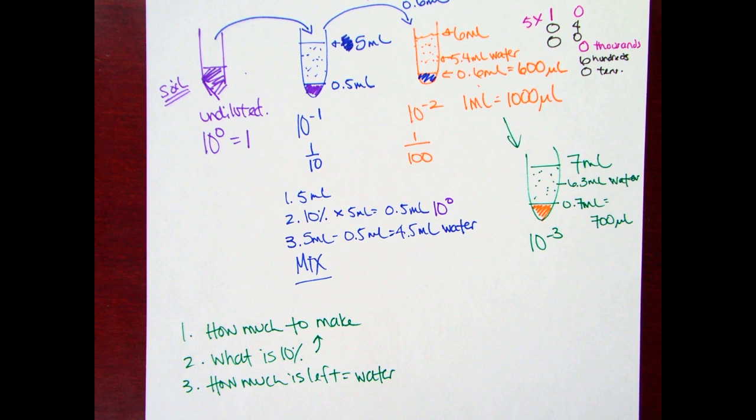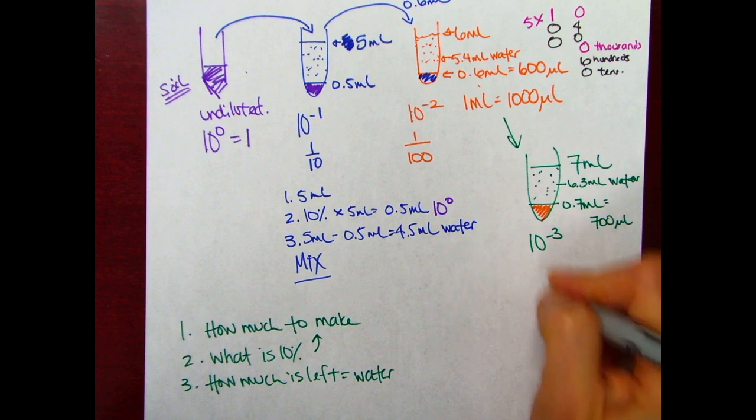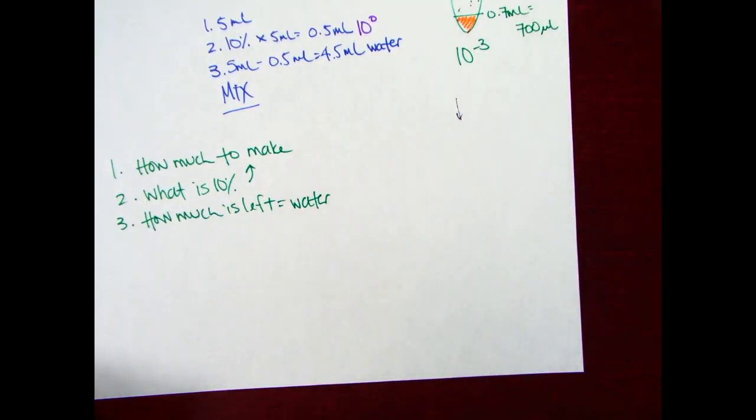We are finally ready to make our 8 mils. I'm a little bit out of markers. Hang on. We'll use a black one here. All right, so finally we're going to make, I don't actually know if this one's working.